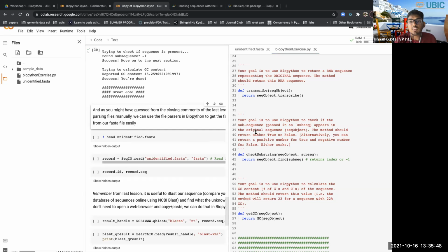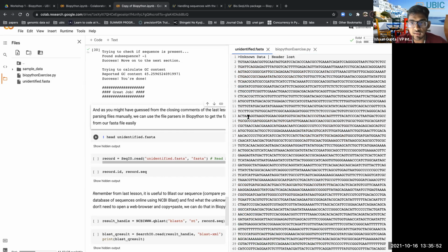All right. So now for the second part, this FASTA file, instead of looking at the head, we can just open it even honestly. So this is the header line, what it's called, right?